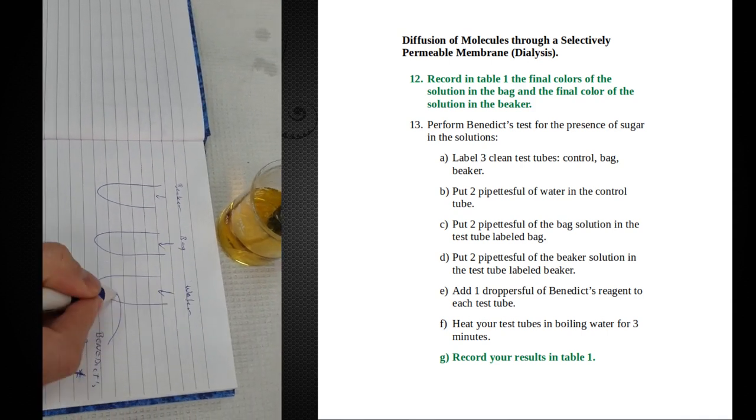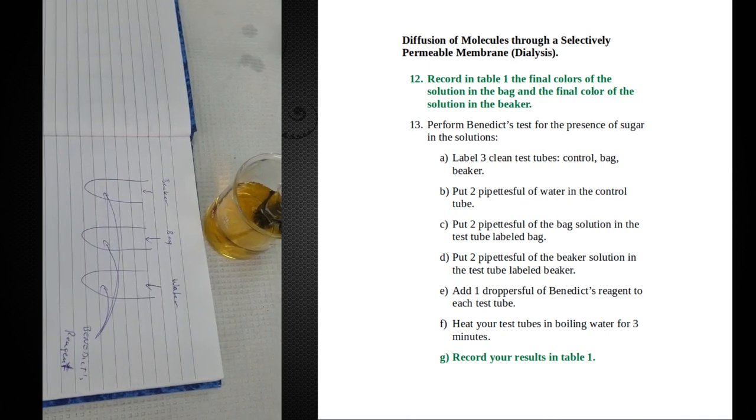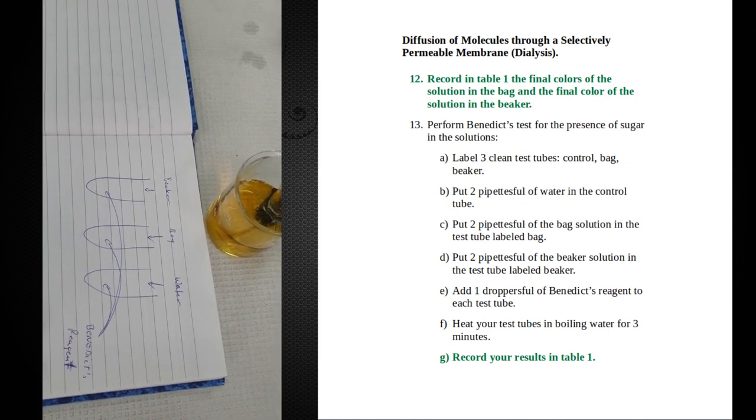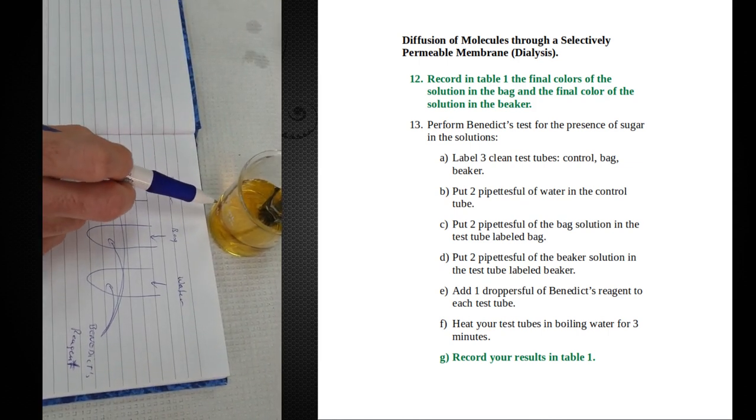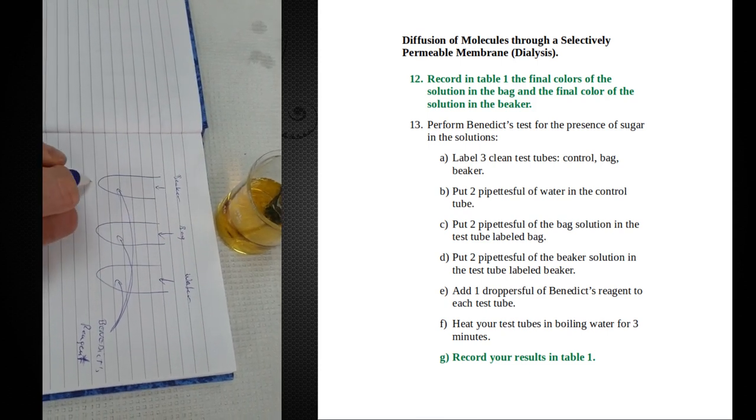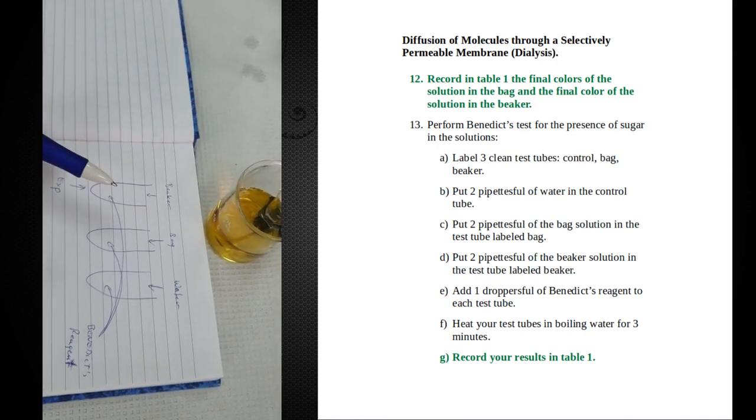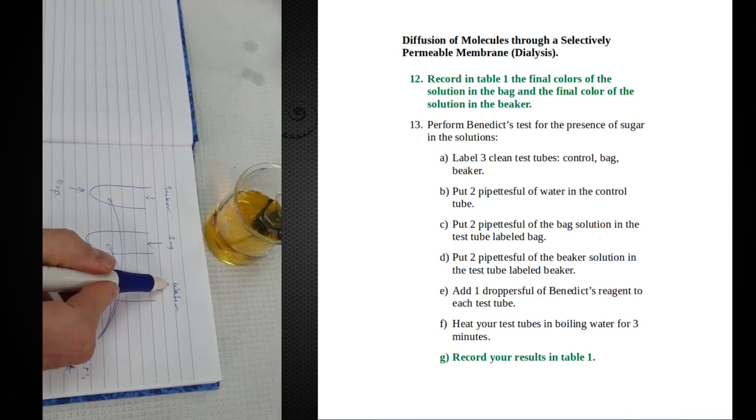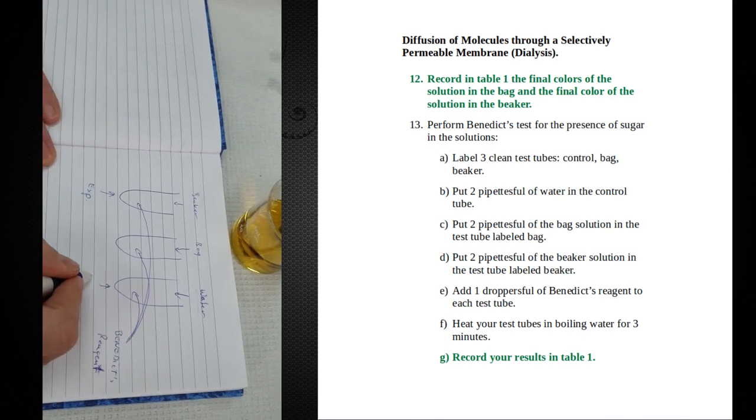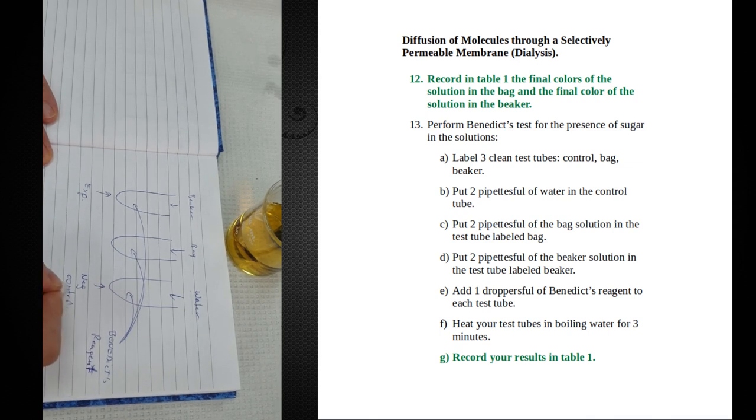Each of these will get the same amount of Benedict's reagent. We're setting up an experiment that has some controls and some experimental tubes. Now, we don't know what's in the beaker. We want to find that out. So that's our experimental tube. We know what we put into the bag, and we know what's in water. We know that water does not have glucose, so this is going to be our negative control.